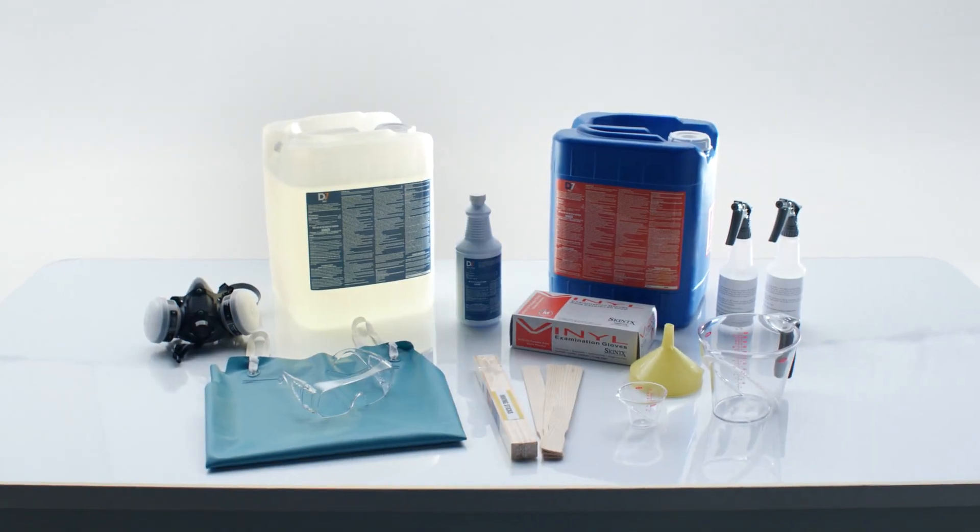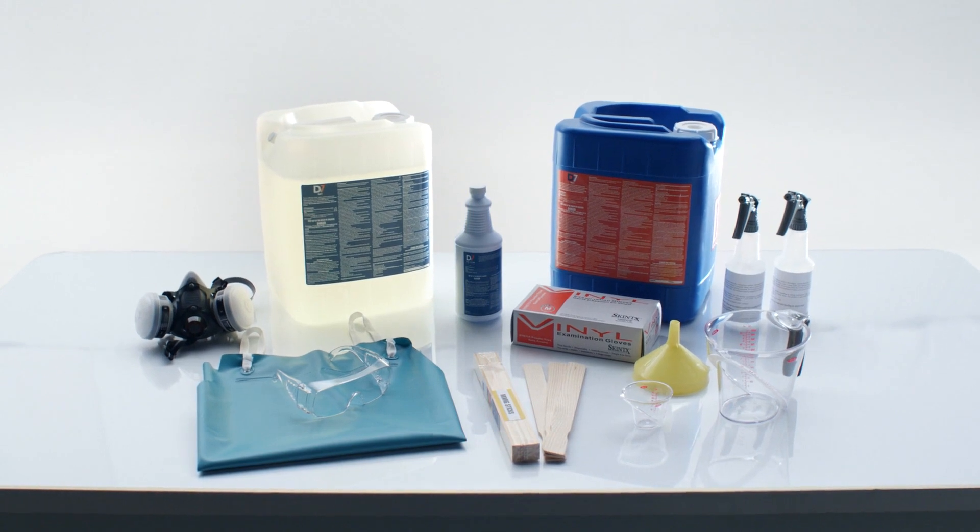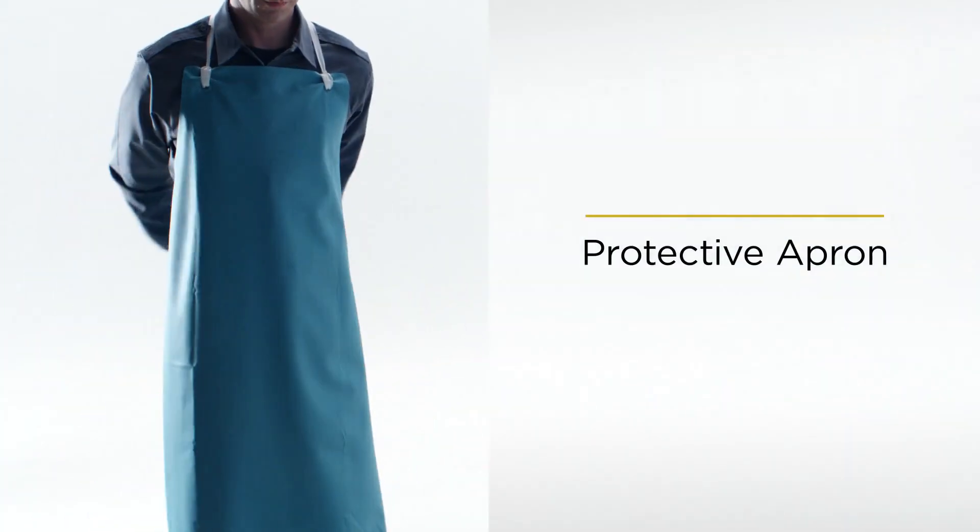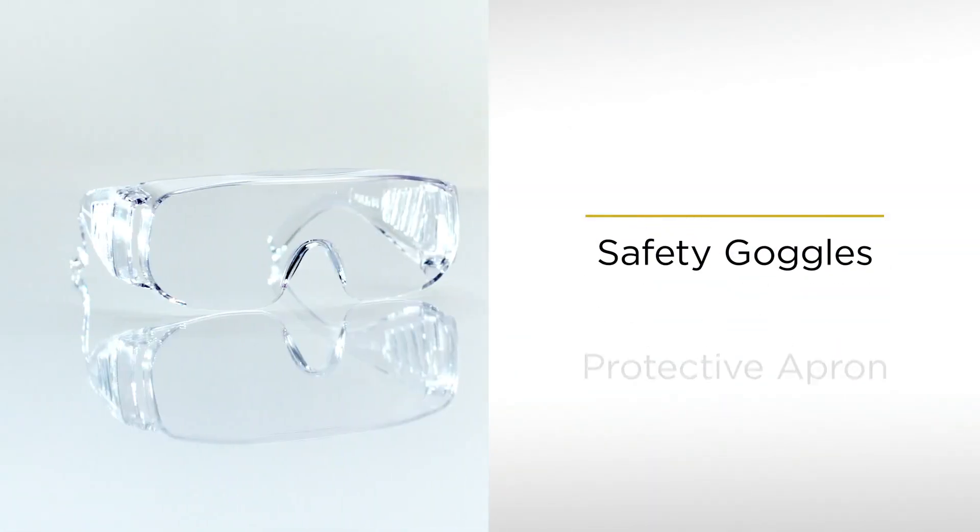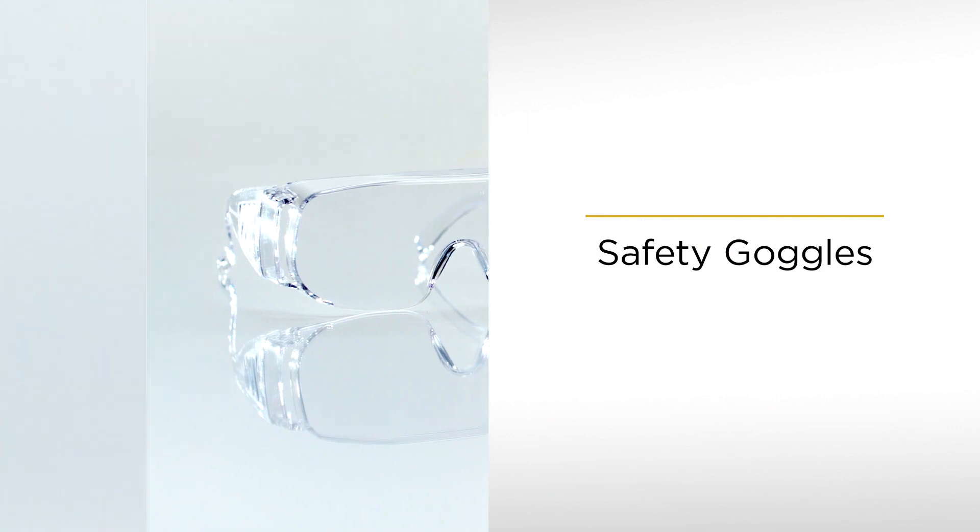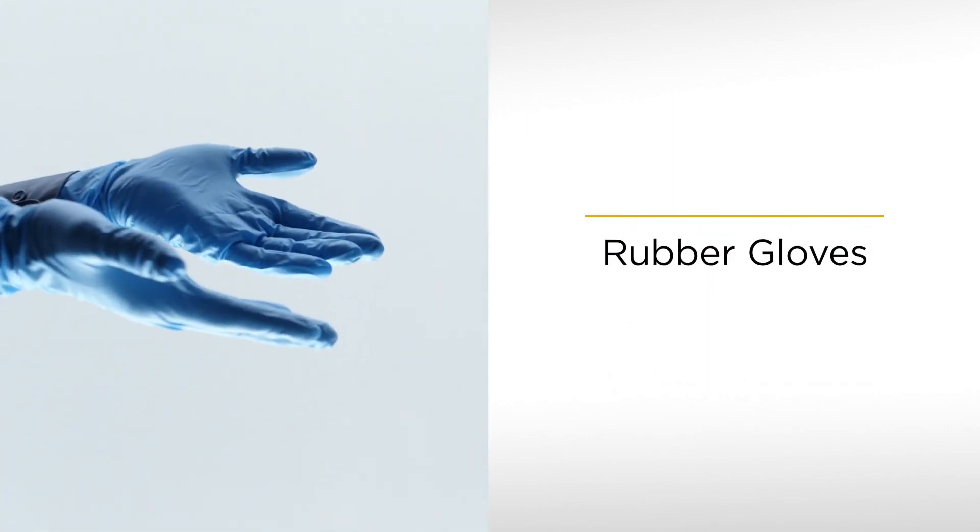You also need all supplies required for mixing: a protective apron, safety goggles to protect your eyes, and rubber gloves to avoid skin contact.